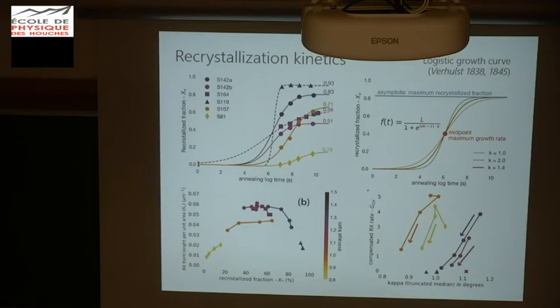Also, you can see this path that goes down to speed equals zero when the recrystallization stagnates. These samples here stagnate at around 1.0 kappa, but if you project these paths here, it would be at lower values. So overall, this is an indication that the local average misorientation is also controlling the stagnation of the samples.